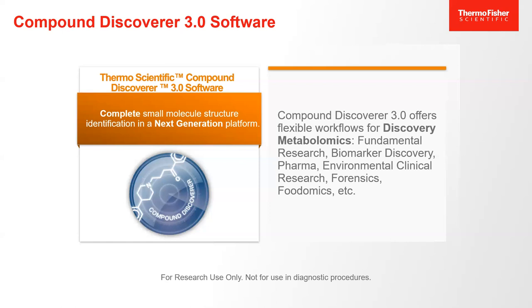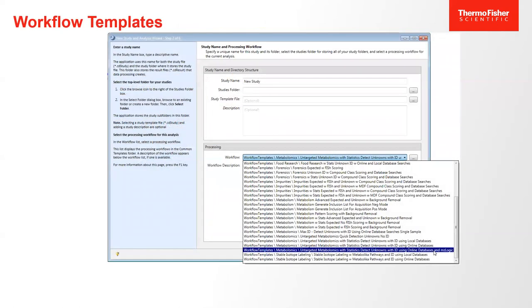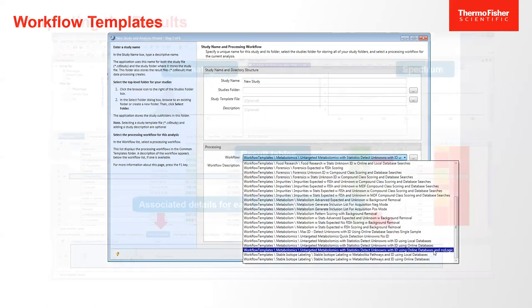Secondly, CD and PD are both client-server. You only pay the license to do the search. Well, you can install the software as many times anywhere you want and view the results and do the statistics and do the pictures and do the biology, okay? So it's only the actual search function that's licensed. Now, you're gonna do a few steps. I kind of showed you an earlier picture. We're gonna define a workflow. And Proteome Discoverer and Compound Discoverer come with a large number of workflows already built, depending on what you want to do. Okay. You could grab any of them, grab the one that sounds close to what you're interested in, and you modify from there. Okay.